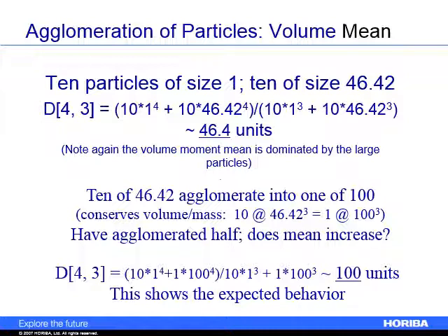So the whole point of this thought exercise is to have you understand two things about particle size that are really important: how you convert one method of counting to another, and how you do your statistics and how your understanding of it is. If you're breaking stuff down and trying to do this by microscopy, that's a number count.